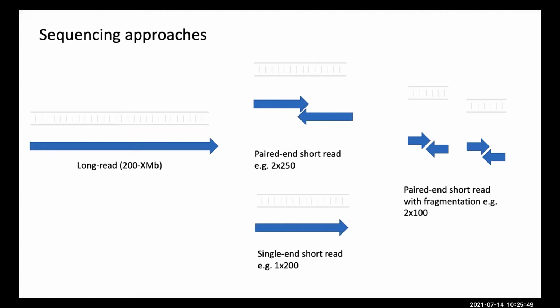With Illumina sequencing or Ion Torrent sequencing, you have either SBS or flow-based chemistries. You need to make sure that your amplicon is compatible with the read length of your sequencing chemistry, and that either means that you need to figure out what's your maximum paired end read length and make sure that you can overlap an amplicon so you generate the whole sequence of it once you've sequenced both reads, or that might mean that if you have long amplicons you need to do some kind of fragmentation, which is the situation on the right hand side.